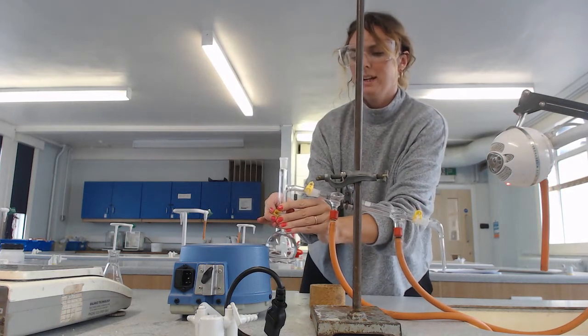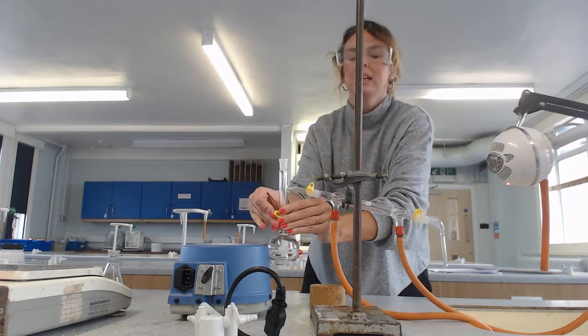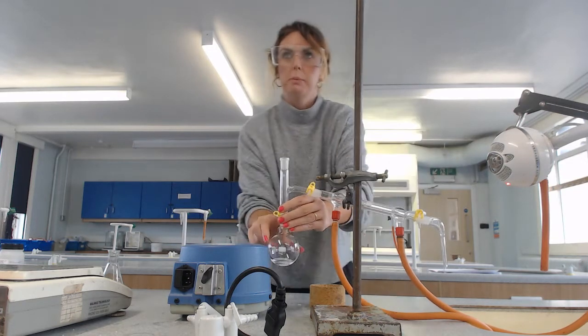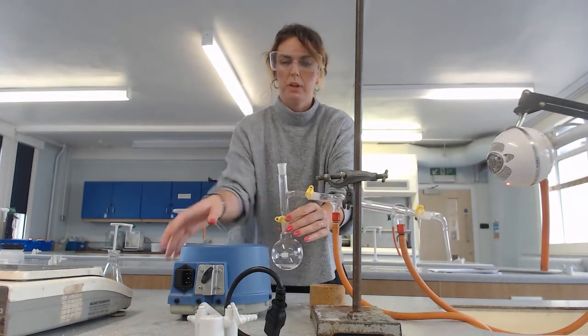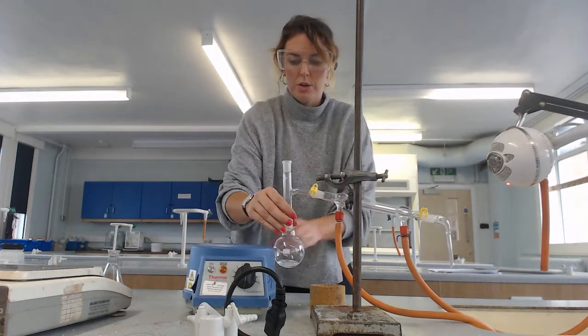Pop in the clip, make sure it's the right way — small bit, big bit — and then that's nice and secure. Now what I've got here, if I turn it around to show you, is called a heating mantle.